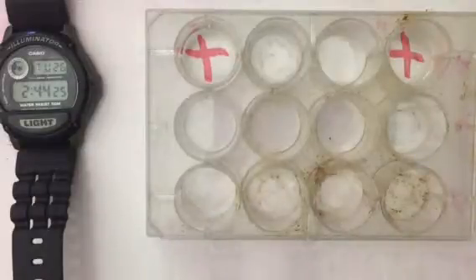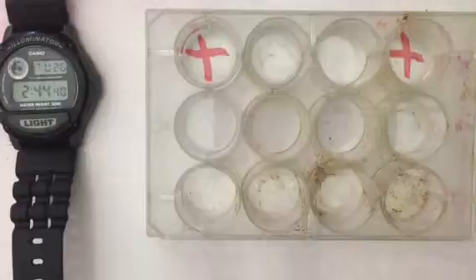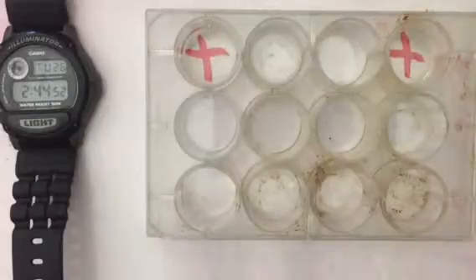So this is kind of a cool reaction. Now, first of all, I have to give credit where credit's due. This is done by Bob Worley from Cleapss in England, and also Flinn Scientific does a version of this, so I tried to make it a microscale. It's a little bit different in that I'm using a camera and a clock, because what we're going to see slowly as the sulfur starts to form, after a while, you're not going to be able to see the little plus sign there.